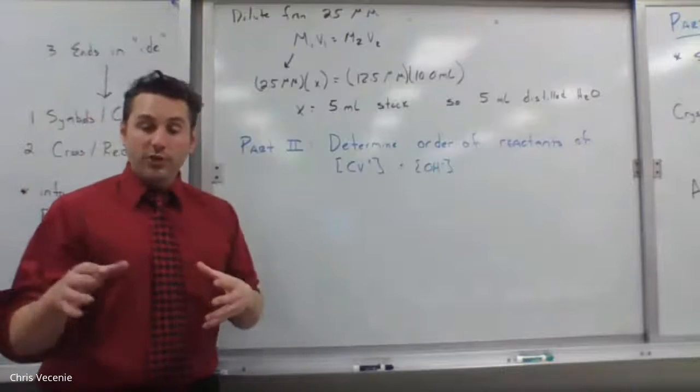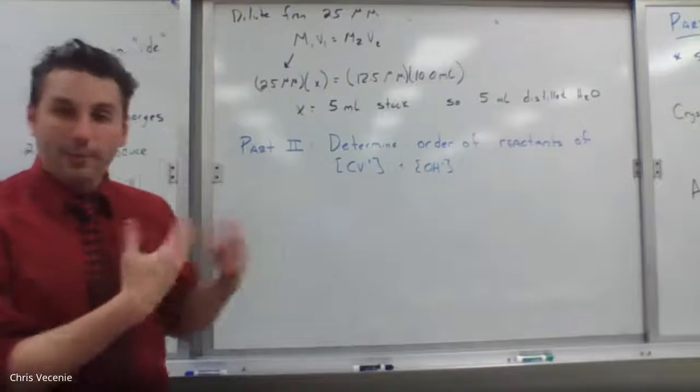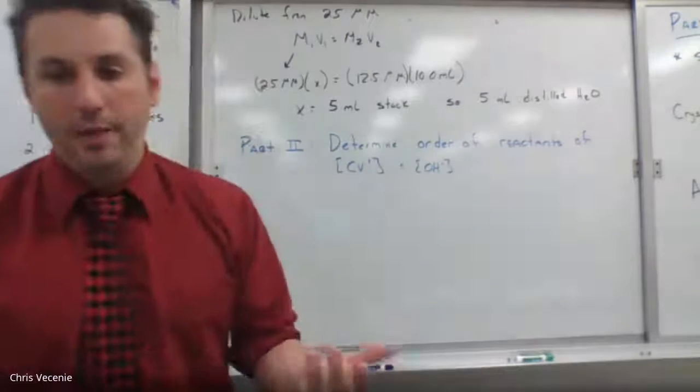All right, so I'm going to show you the setup of that dilution, and then we'll come back up and show you how you create your Beers Lambert plot. So let me carry you guys back there.